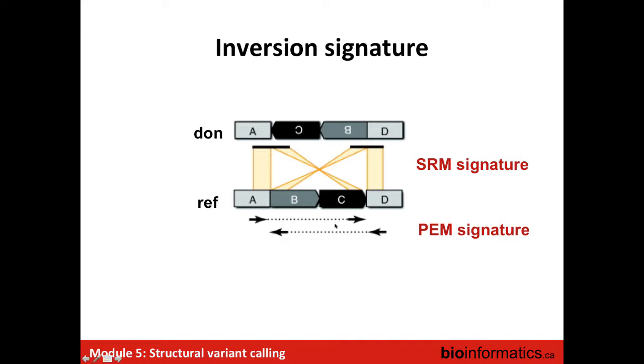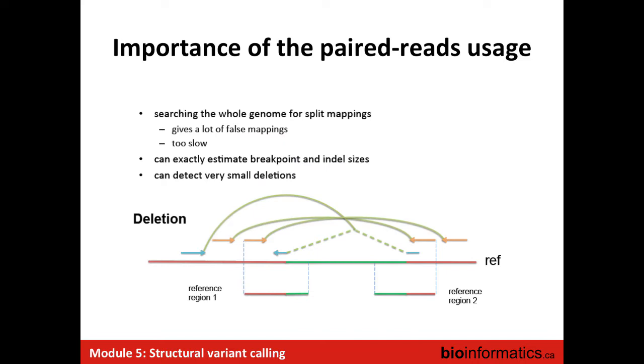So as you can see in this presentation for the split read, I always compare and show you split read versus paired-end mapping, because now the way the new tools analyze the data is to mix both signals. That is how the new tools are working. So it's important not to only use split read, but to use split read and paired-end mapping at the same time.